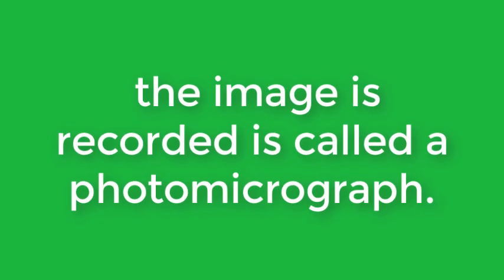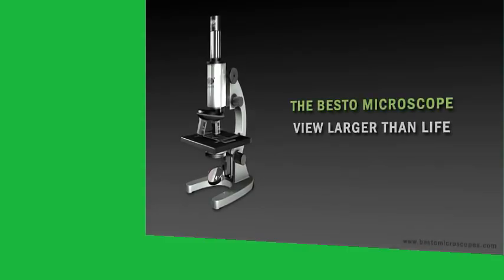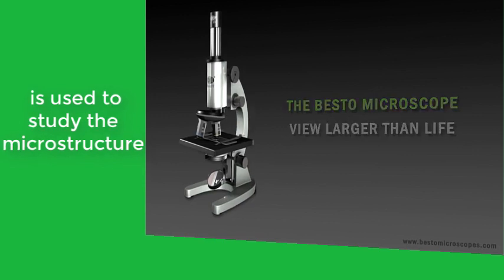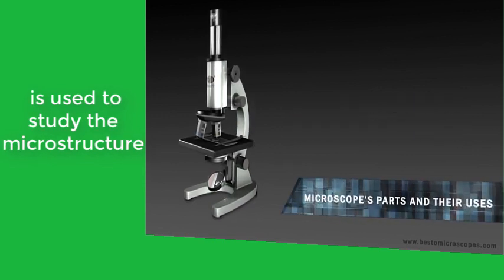Some of these techniques employ photographic equipment in conjunction with the microscope. The photograph on which the image is recorded is called a photomicrograph. In addition, many microstructural images are computer-generated and/or enhanced. With optical microscopy, the light microscope is used to study the microstructure. Optical and illumination systems are its basic elements.